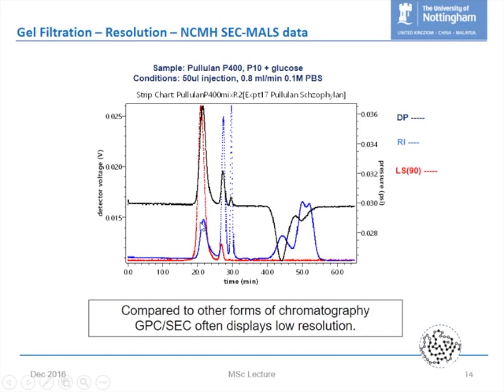And in addition to the refractive index, we've got light scattering. You can see the large polysaccharide scatters a lot of light. They're in there at a roughly equi-concentration, by the way. The smaller molecular weight scatters less light, and glucose doesn't scatter any light. In terms of the viscosity trace, you can see we've got a similar situation here, except the glucose does have a finite viscosity change.